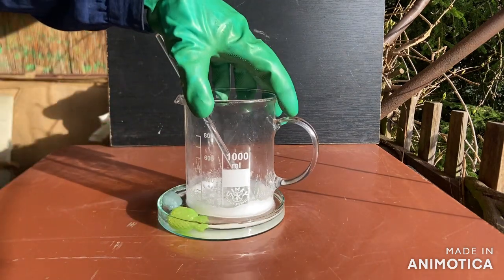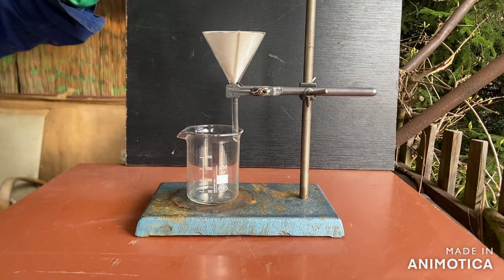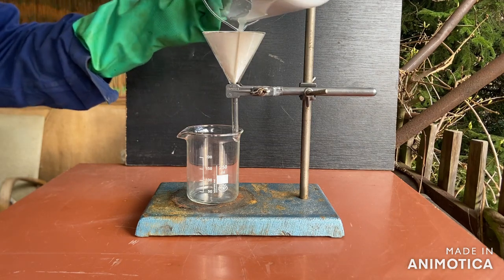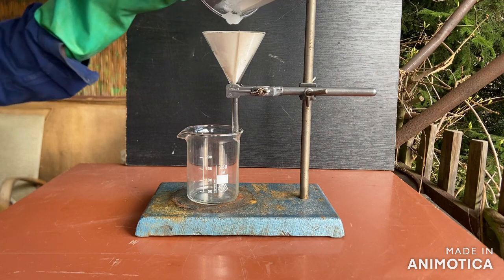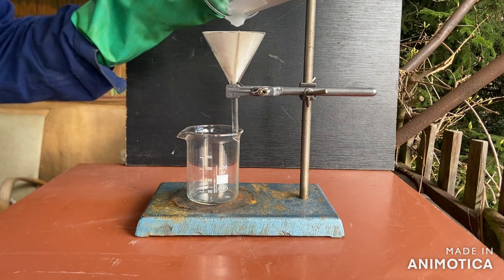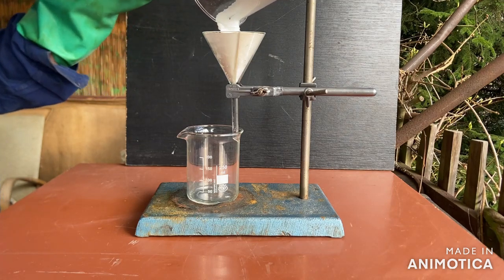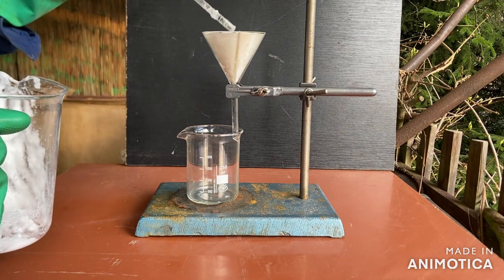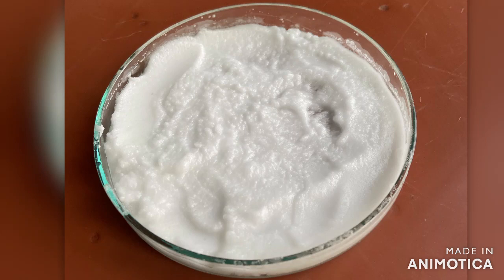Now I just need to set up a filtration apparatus. I poured the contents of the beaker into the filter paper and let the water drain. Here is the still wet product. If you enjoyed the video, consider subscribing.